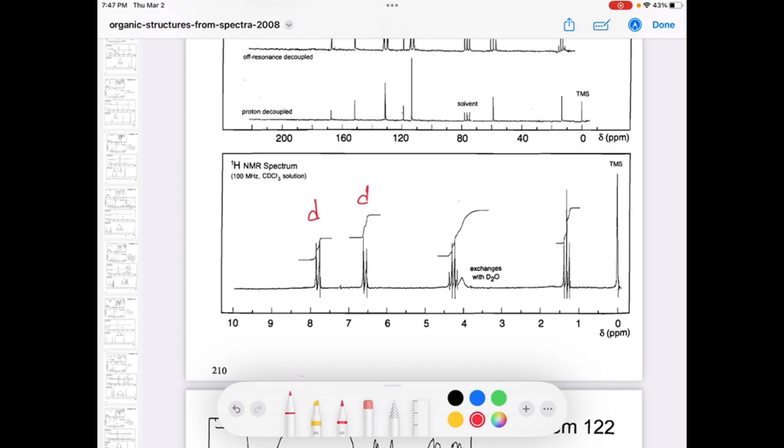So yes, I told you last time, if you have a 1,4-disubstituted benzene ring, with positions 1 and 4 having something, in that case it should give you two doublets. So there are two different kinds of proton. If this is A and this is B, similarly this is also A and this is B.